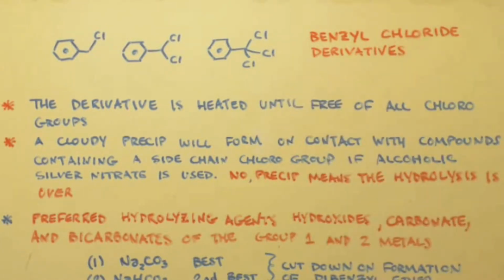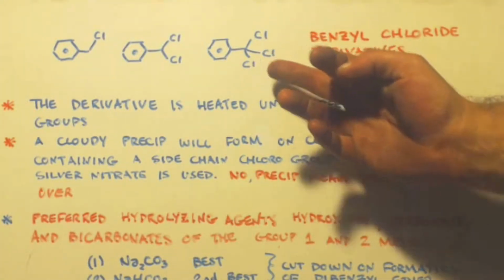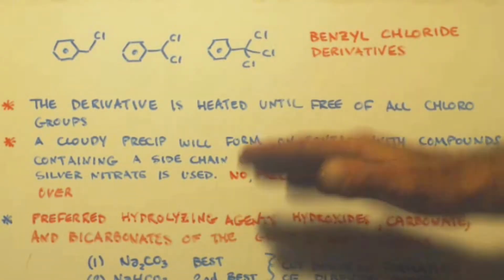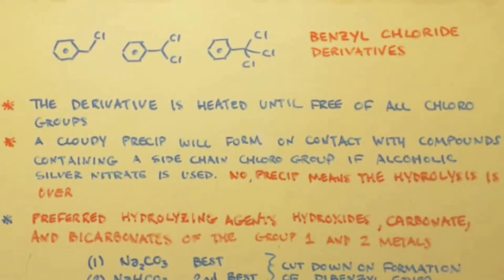Some of it probably won't react at the very end when there's only a couple molecules of benzyl dichloride, and everything else is trichloride. It's going to be tough for the chlorine to meet up with that 1 or 2 molecules. So you know what I mean? You're not going to get probably a full conversion, but should get close. But anyways, when I say benzyl chloride derivative, I'm talking about these 3 things. We're going into how to hydrolyze them.